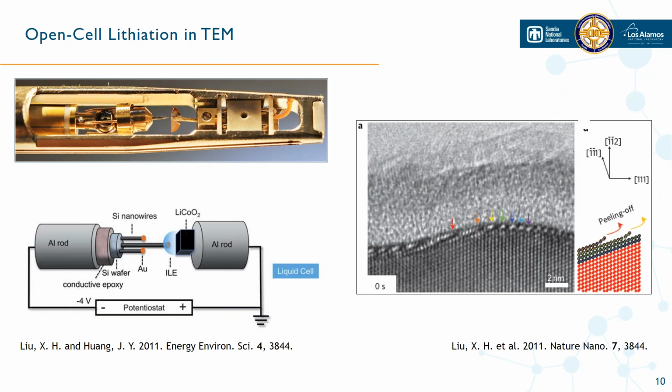On the right are some beautiful results that were previously obtained, showing that you can obtain atomic resolution information. But you can see that this is a very small field of view that you're acquiring for these types of experiments. What you can pay attention to in the next slides is how much we're able to collect by using this camera in combination with this in situ holder. So let's go to the next slide.